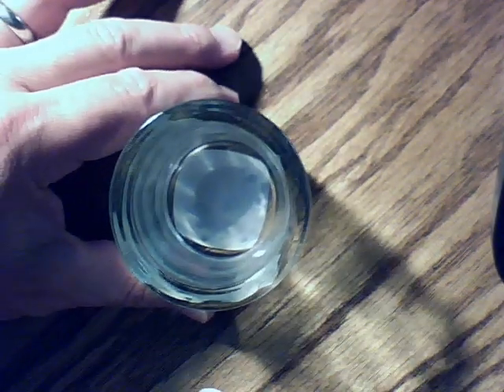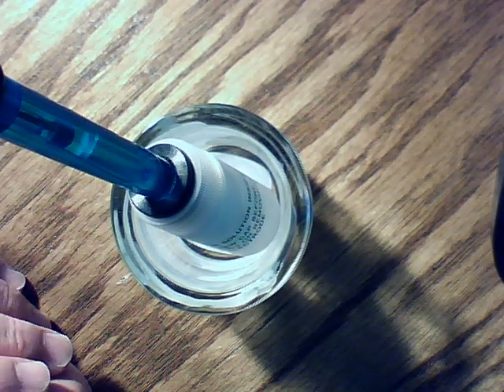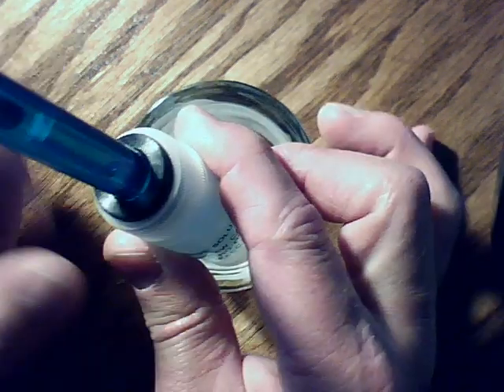When you take this out, the first thing you need to do — I've given you one of these glass containers right here. Simply put your pH meter in like that so that it stands upright. Anytime you're not using the pH meter, leave it standing upright. This makes it easier to remove the pH meter when you need to.